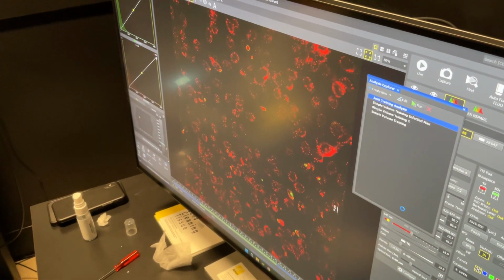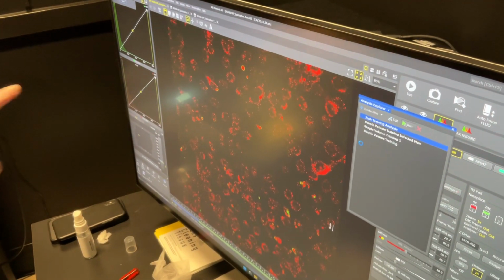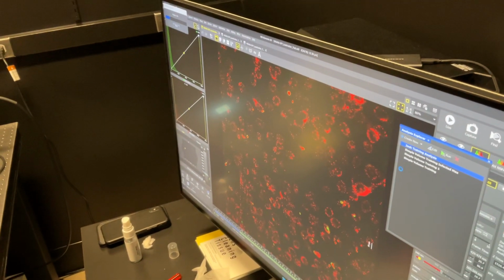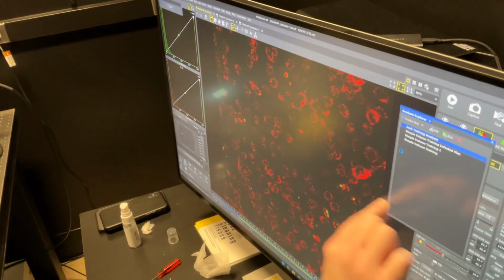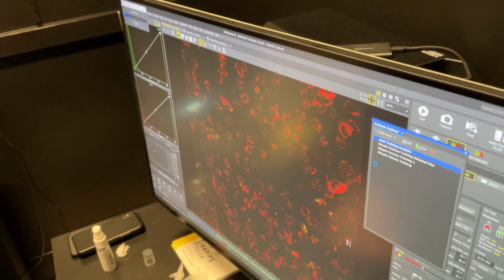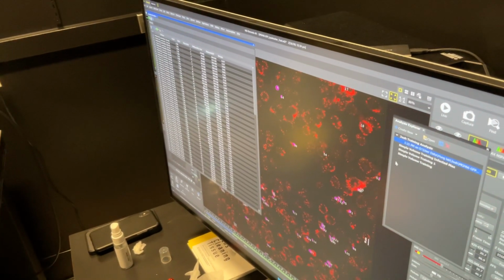I guess my question is, all of these analyses we've previously run are going to be saved in the analysis explorer? Yeah, I'm going to show you. We'll just let this one run. It's got to do the pre-processing, so this will take time. When you batch it, you will see this red indicator pop up, and then it'll be like, don't touch the computer. Analysis and process, and you'll see it opening and closing files, and that's it. And there's the numbers.